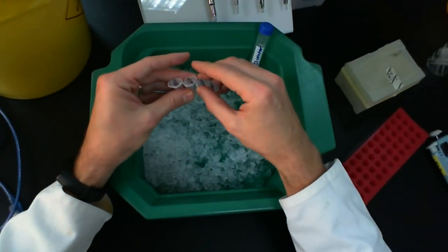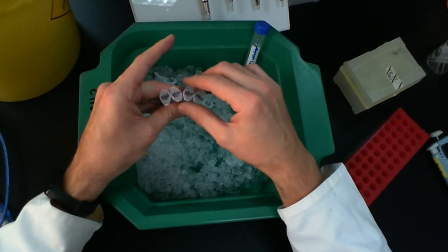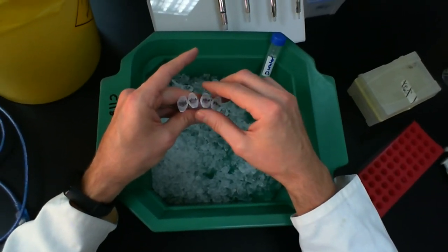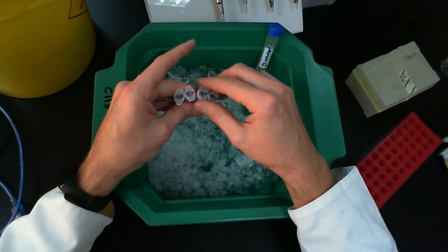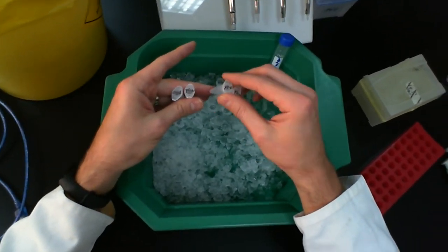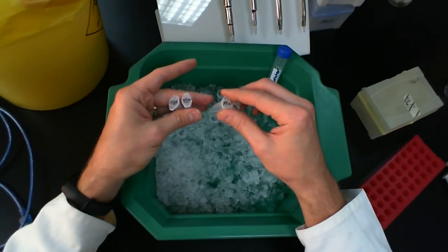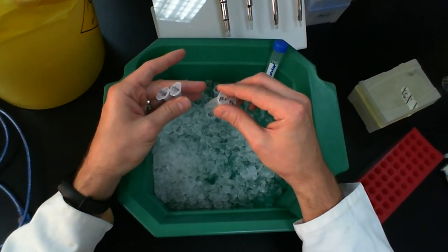Then you're going to take these over to the water bath and incubate them. Now technically SmaI is an enzyme that can cut quite efficiently at 25 degrees Celsius, so you could technically just leave it at room temperature on your bench, well, probably not at room temperature in here because it's a little bit cooler than that, but 25 degrees would be a good temperature to have.